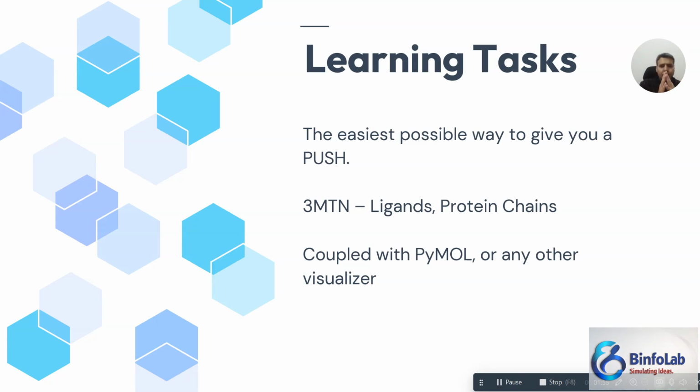Because it contains ligands and also protein chains. So we will have the luxury to use this structure for calculating the ligand interactions and also the interactions between different proteins, or protein chains, in other words.